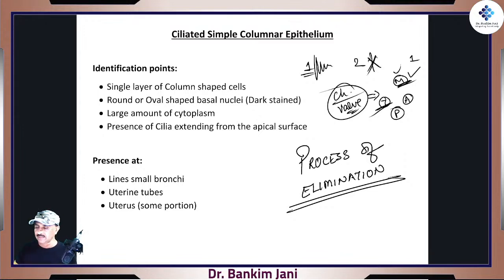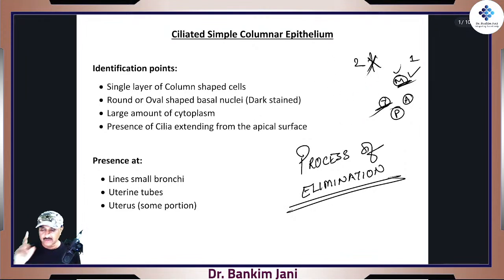During histology slides, we'll be doing exactly the same, right? Because now we know that we can identify the type of cells with confidence. So the first step, forget about which organ. First see which cells we can see. That is the beginning, the first step. We'll never jump to any conclusion, that is first, and we'll never cram anything, that is second.